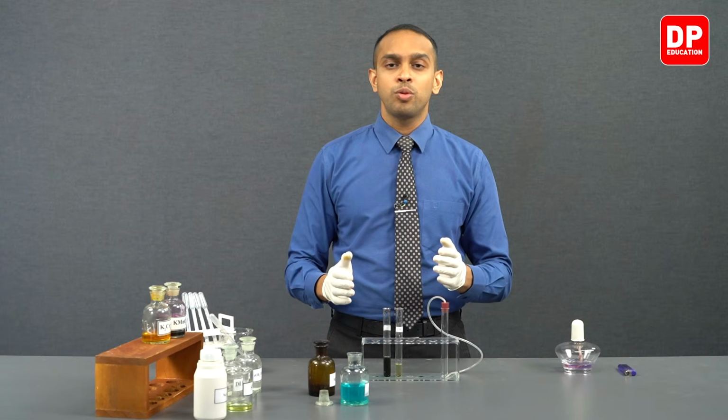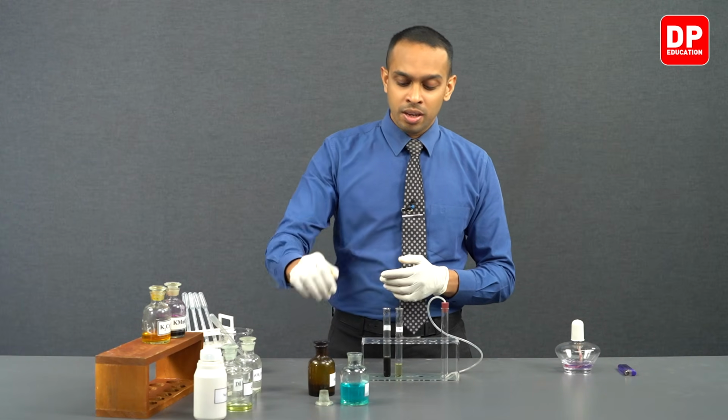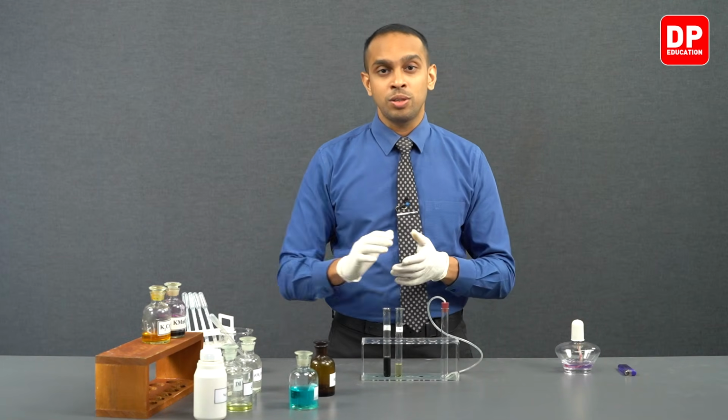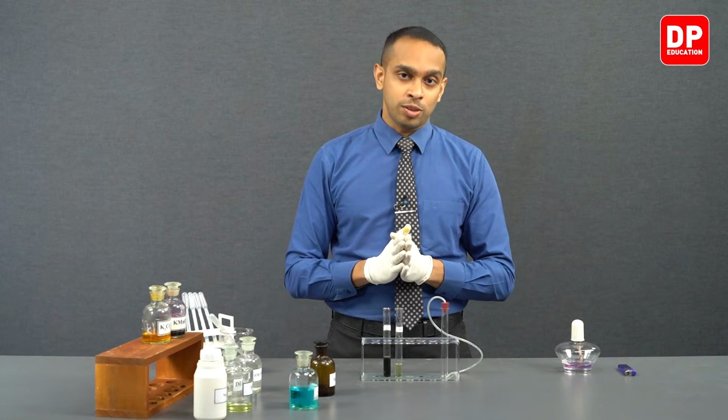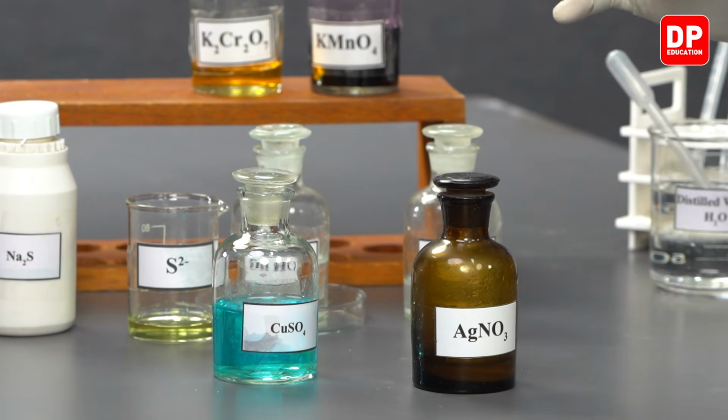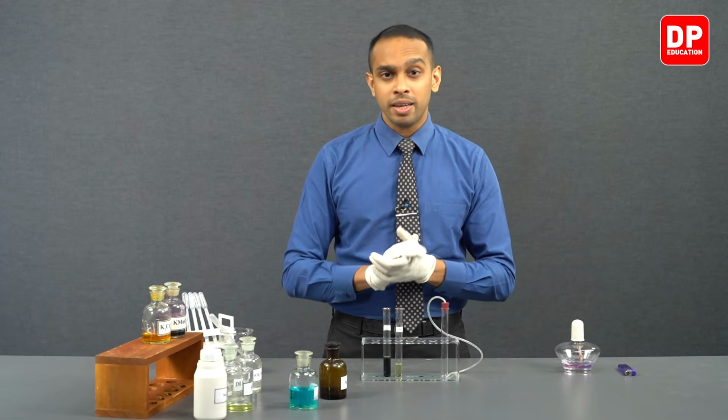Now we can move on to adding silver 1+ ions into our sulfide ion aqueous medium. So in a silver nitrate solution we have silver 1+ ions.